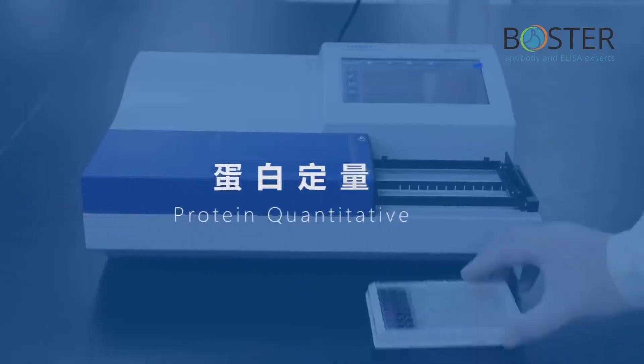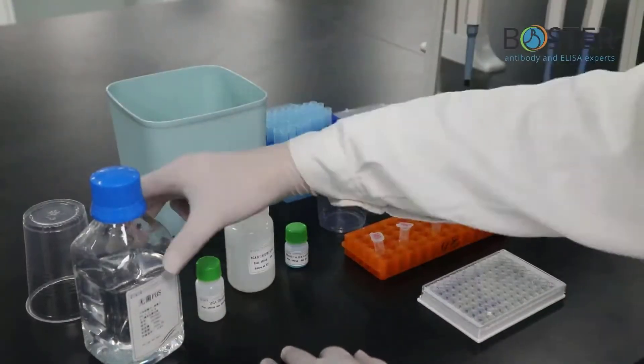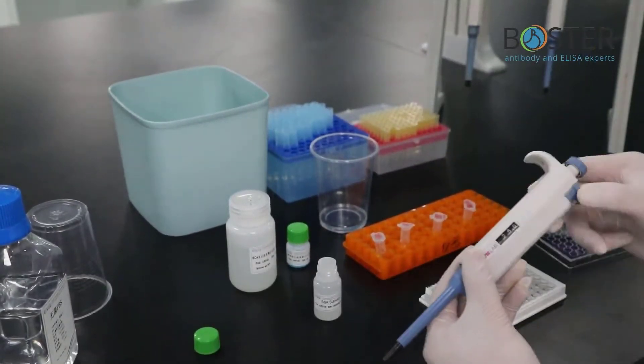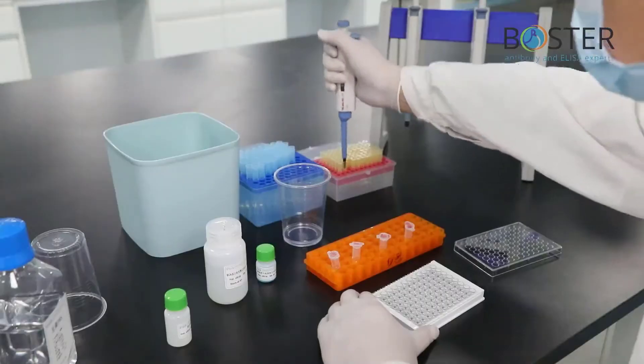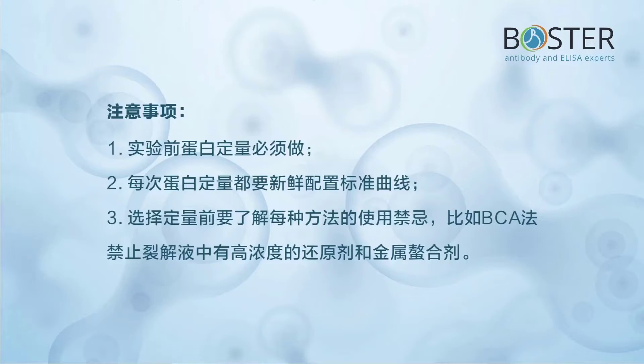Step 3: Protein quantification. These are the products needed for protein quantification. Prepare standard curve, add standards and surrogate samples, add color developer, and incubate at 37°C for 30 minutes. Measure OD value by microplate reader. Create standard curve and calculate protein concentration. Precautions: 1) Protein quantification must be done before the experiment. 2) The standard curve should be freshly prepared each time. 3) Understand the contraindications of each method — for example, the BCA method prohibits high concentrations of reducing agents and metal chelating agents in the lysate.